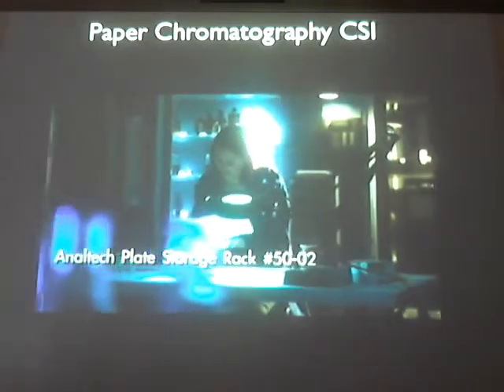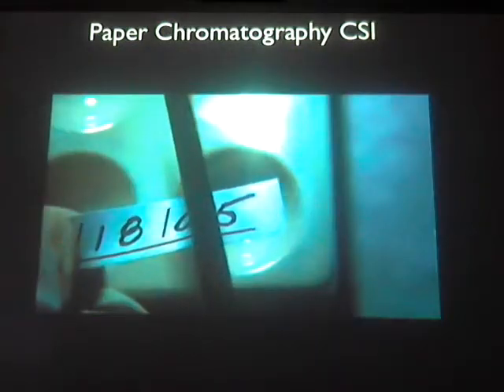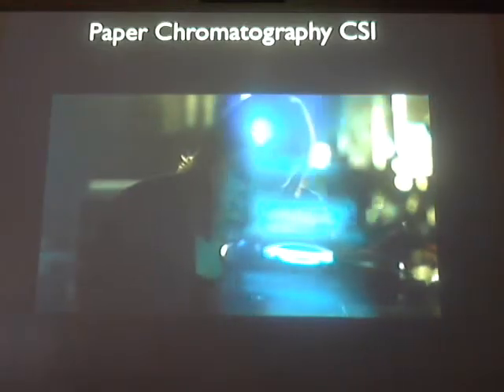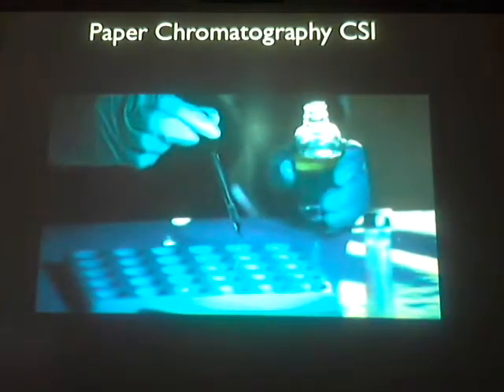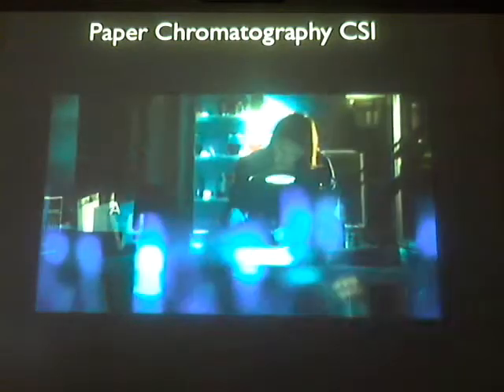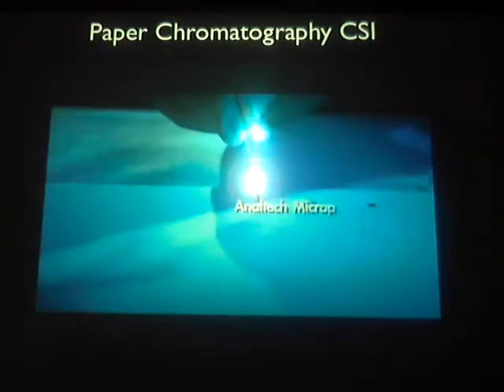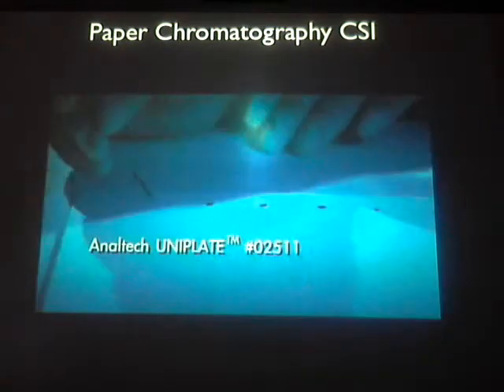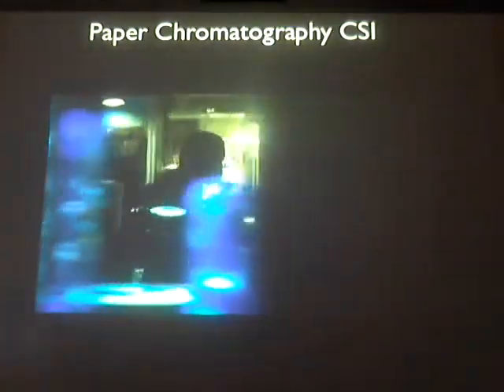Now watch what she does. Cuts this off. Watch. We're going to be doing something very similar. We'll be doing that too. That's a pipette. Capillary tube. We'll be using that. And then we'll be doing this.